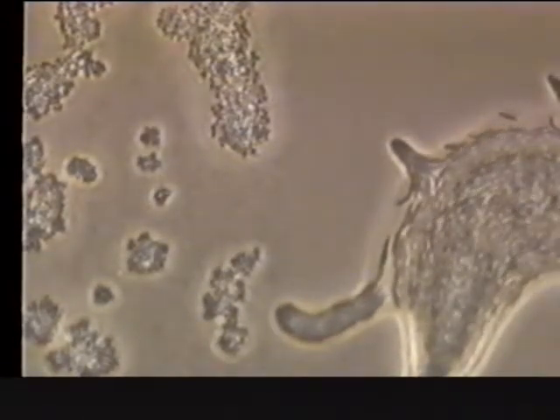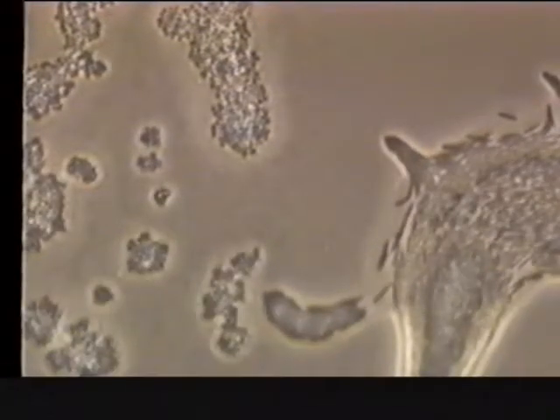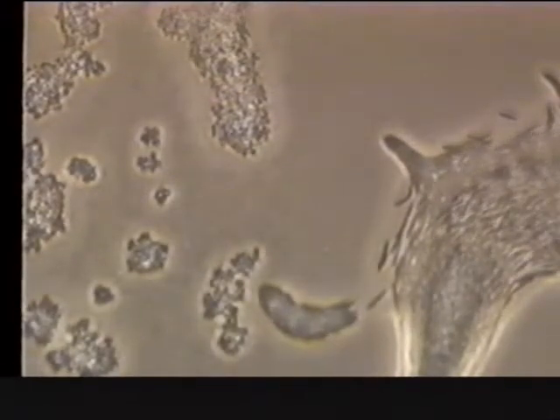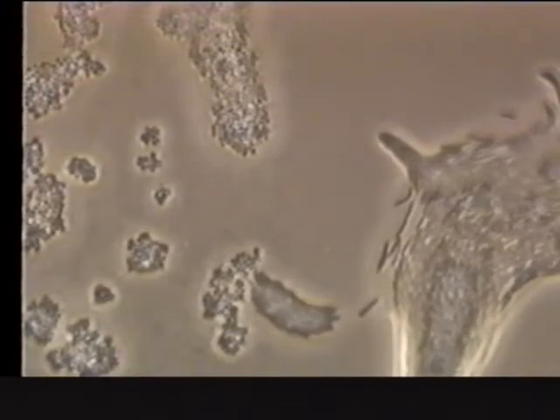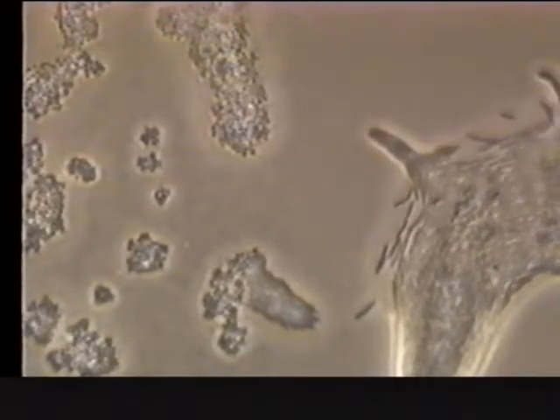And pretty soon the Micrococcus will be dead meat. They always seem to move faster as they get closer to the Micrococcus.